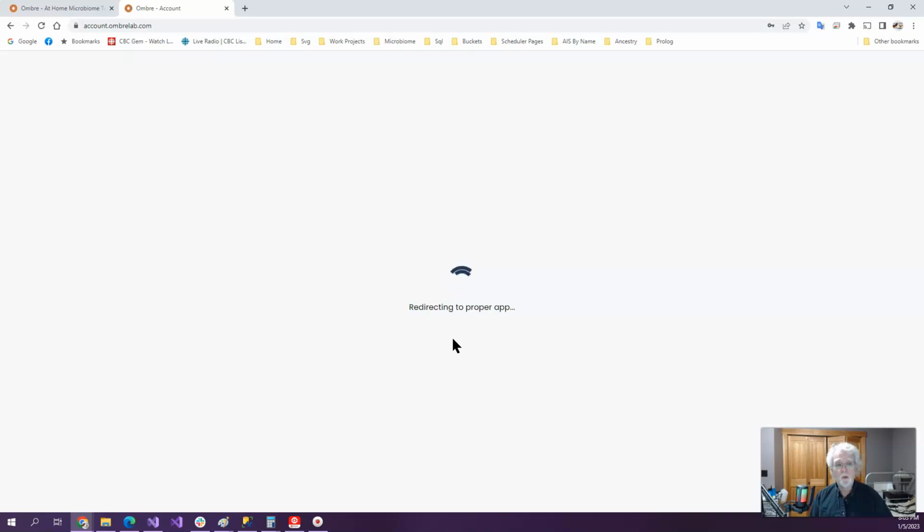As you see, we're usually spending a fair amount of time waiting. We actually spend more time waiting on their sites than you will on my site. So interesting comment about performance. Then again, I'm a long-time performance expert, so I'm not surprised my site runs faster than their sites. So we wait, and perhaps grab a coffee, take a siesta.